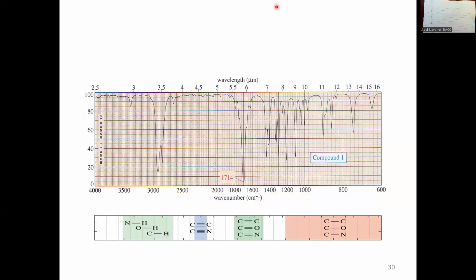Okay, so that's another one, let's see. Compound one. So what is compound one? What do you guys see in compound one? Okay, so I see something around 3000. Each box I think is 100. 3100, 3200, 3300, 3400. No, that 3400 doesn't really. That's a C=O. For me, it's a ketone. It's just a ketone.